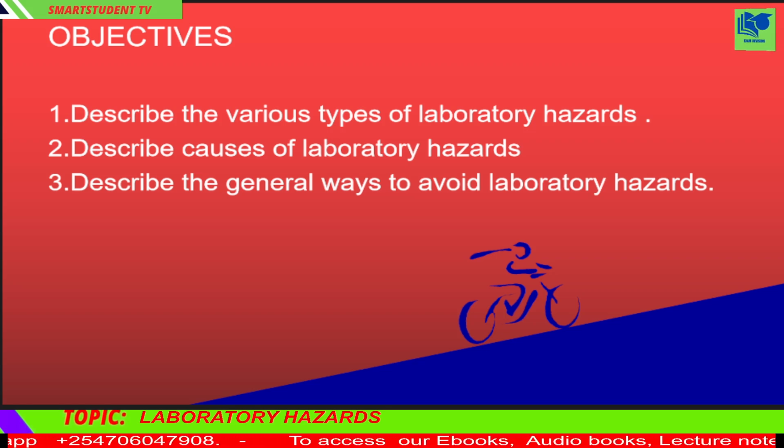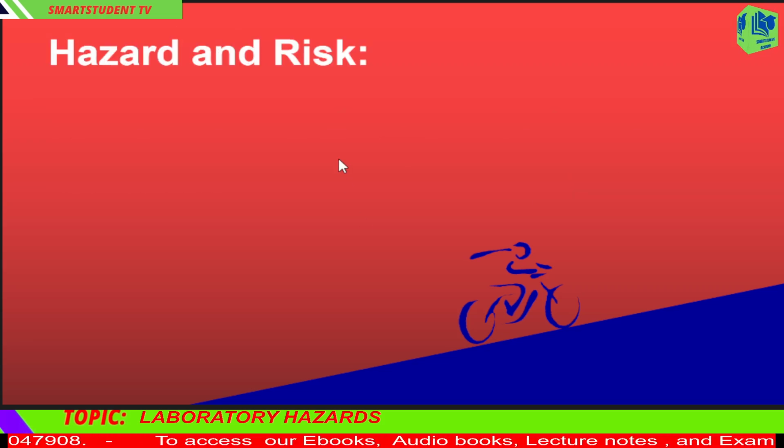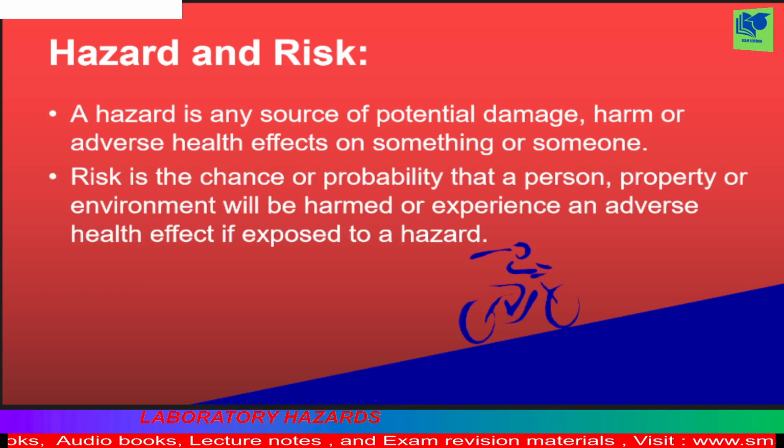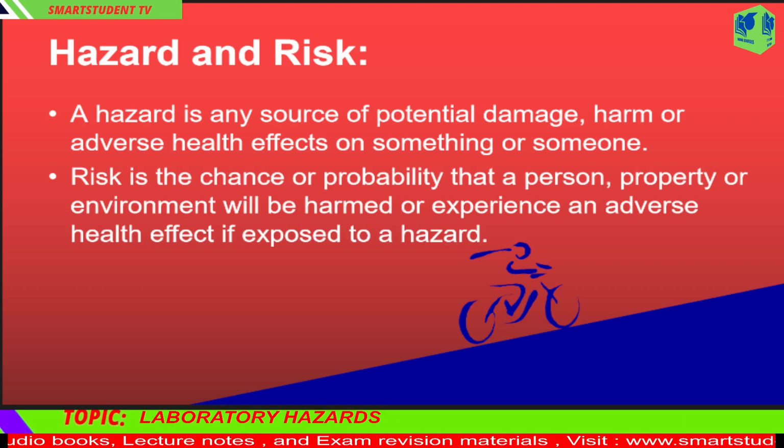Let's get started. Let's start by understanding the term hazard and risk. First, what is a hazard? A hazard is any source of potential damage, harm, or adverse health effects on something or someone. How about risk? Risk is the chance or probability that a person, property, or environment will be harmed or experience an adverse health effect if exposed to a hazard.